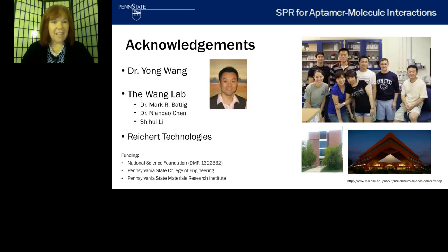Thank you. Our next question: have you investigated the different effects of cations, particularly divalent ones, on aptamer binding?